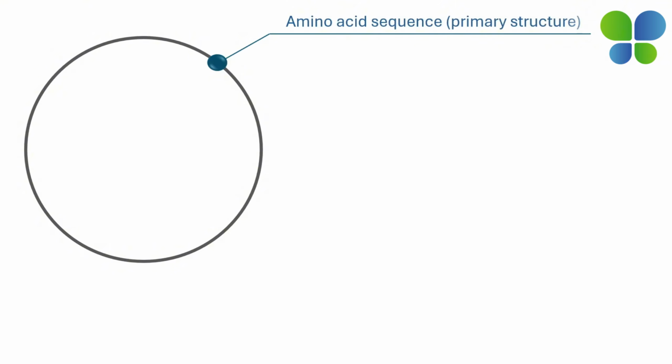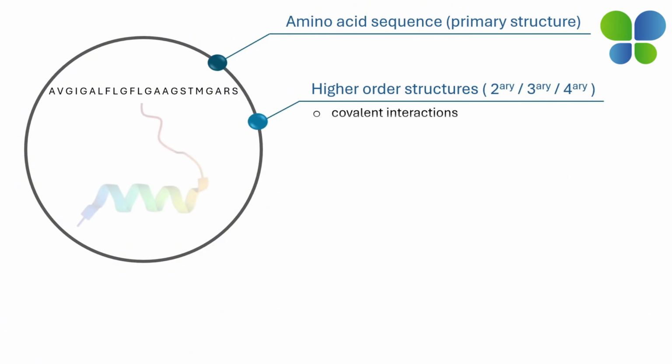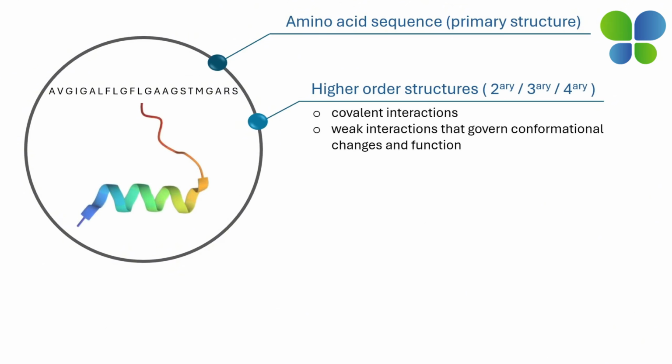The gold standard for protein ID assessment is amino acid sequencing. Today's complex therapeutic protein designs require additional important factors that must be included in the evaluation, such as relationships between the amino acid sequence with weak and covalent interactions that govern secondary and higher-order structures. This relationship is critically important for multispecific and antibody-drug conjugates.